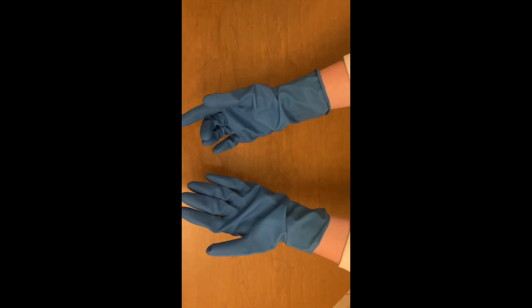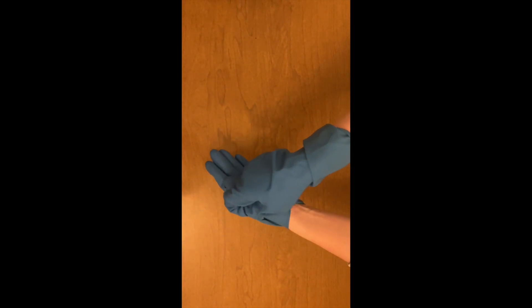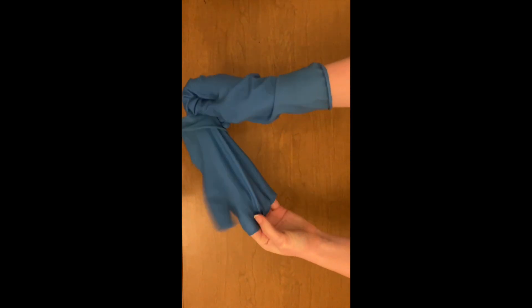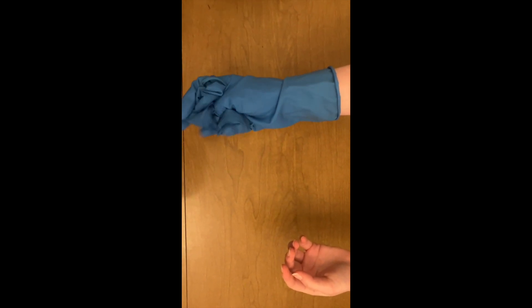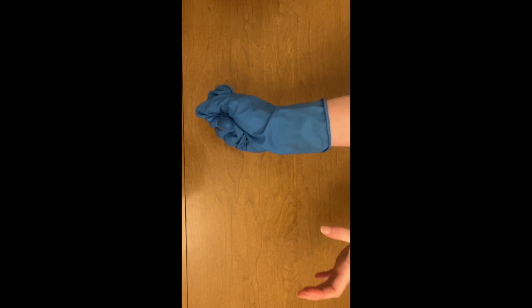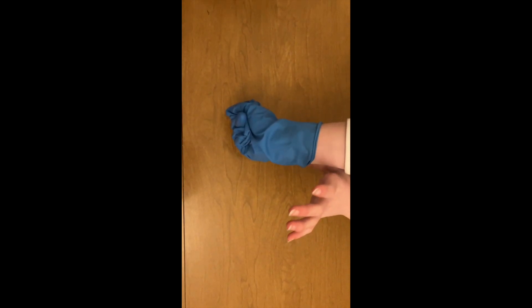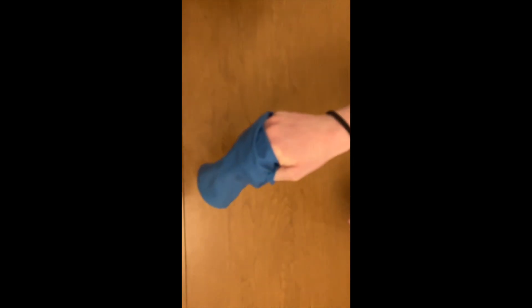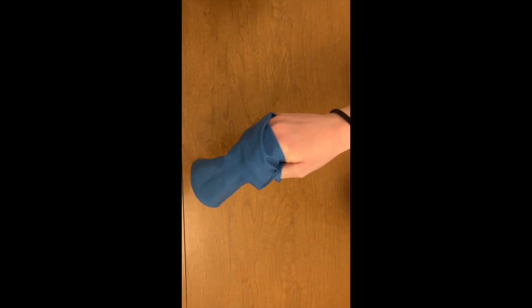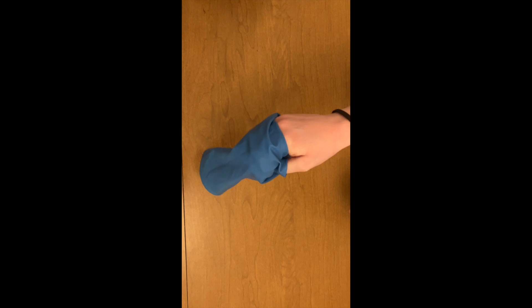In order to take off your gloves, take one hand and pinch the bottom edge of one of your gloves. Roll it off, allowing it to turn inside out, then ball up the glove with your gloved hand. Next, take one finger and carefully slide it inside the other glove without touching the outside. Roll that off, and then throw both gloves away in a plastic bag that is sealed and then put in the trash. Make sure you don't put your used gloves in with your fresh gloves.